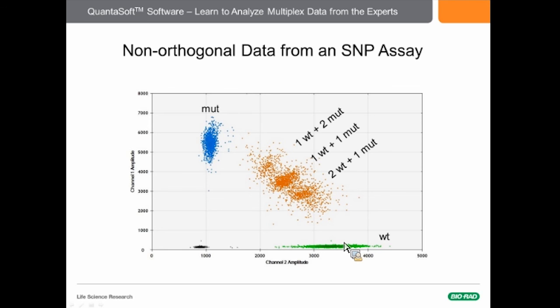The next question we have was, is there any way to filter the data in the event view? For example, rarely something blocks the flow. It would be great to omit those data until the clog clears. That's a very good question. The software automatically will filter some of the data, so there's no way to actually perform that manual filtering.